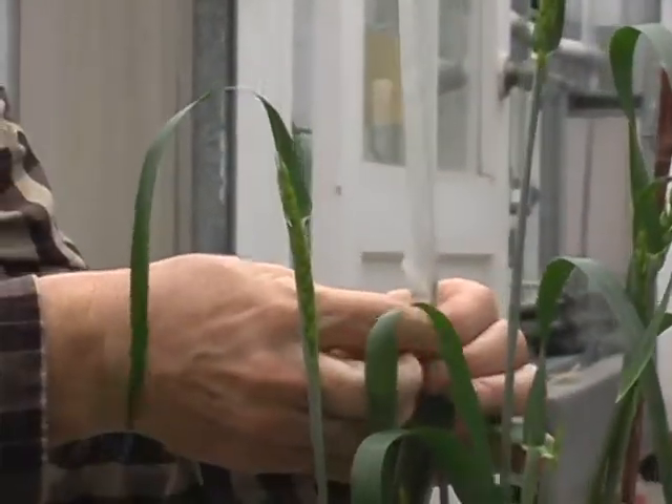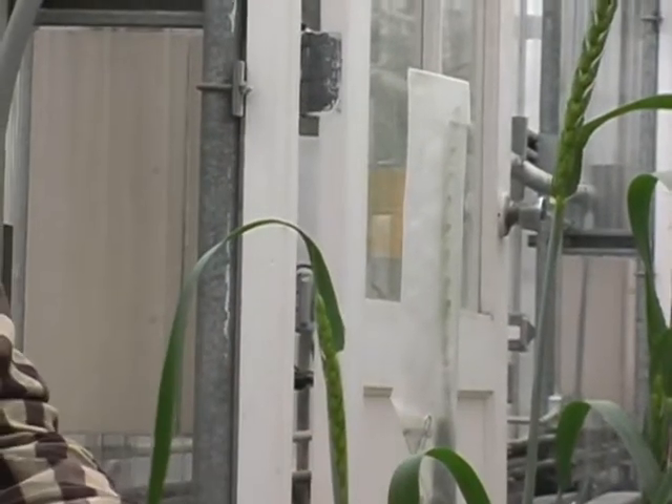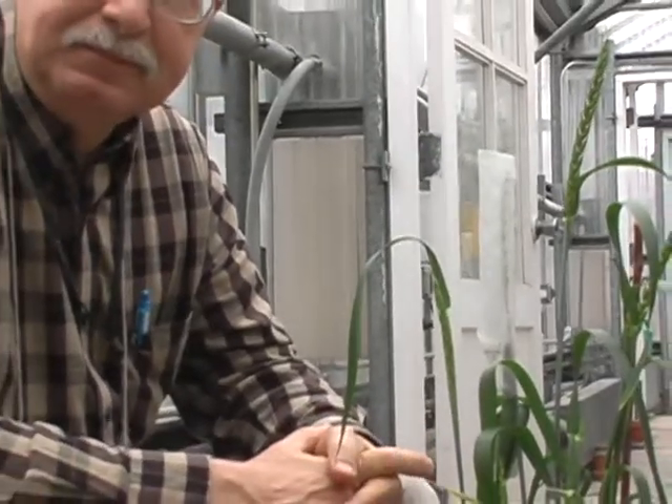Once we seal it, we'll wait one to two days — probably only one day because we're right at the end of the greenhouse season, so we'll have to cross it almost immediately. And that's how we make our emasculations.